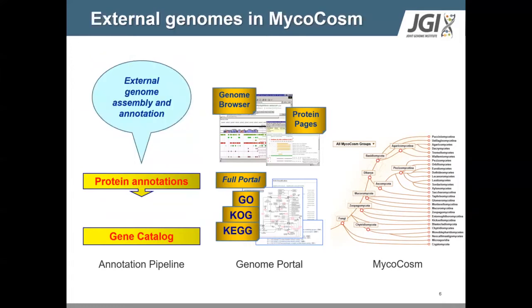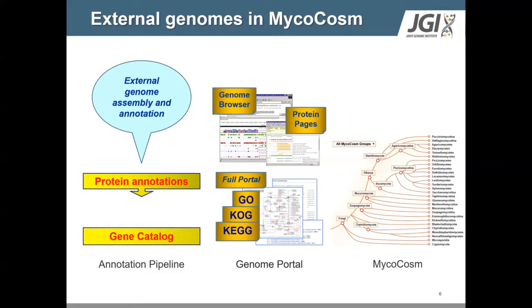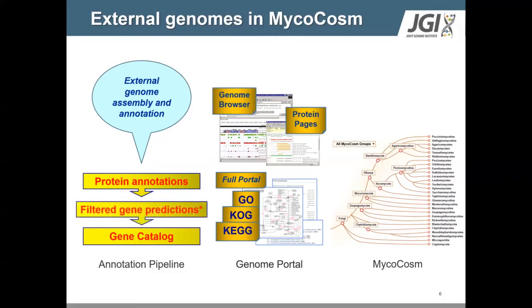As you can imagine, the potential to conduct comparative genomic studies is greatly improved by the incorporation of additional genomes. One major advantage of MycoCosm is that it brings together a massive amount of data on fungal genomics. Much of these data were generated by us. However, we also actively import data sets published by the fungal community. In the past, these were imported as is, but since these come from many sources that take a variety of different approaches towards annotation, we are beginning to apply our pipeline's filtering capabilities to these external model sets to make them more comparable to the ones that we generate internally.